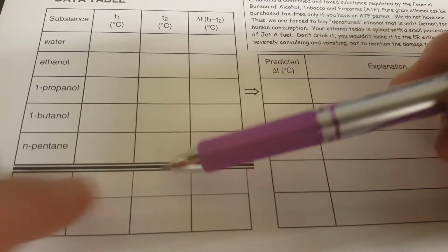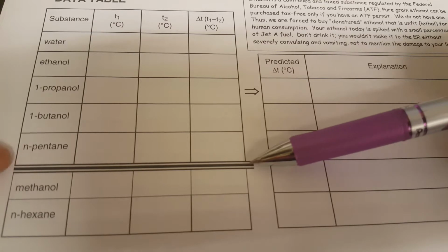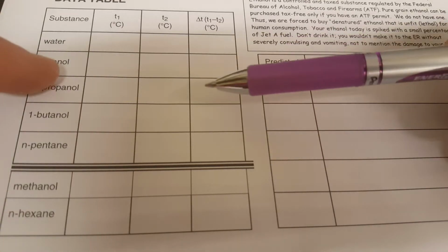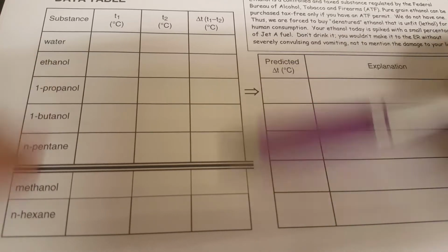All right, now this line may or may not be here in future labs, but I think it's a vestige of Dr. Moody's lab. He created this, and I want you to ignore that line and try to do all of these. All right, keep your eye on the clock.